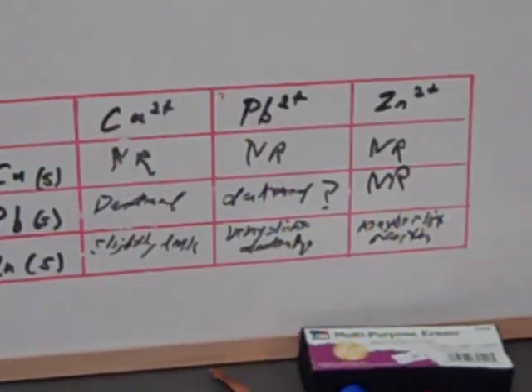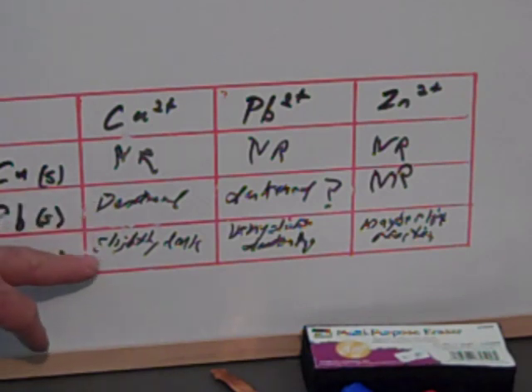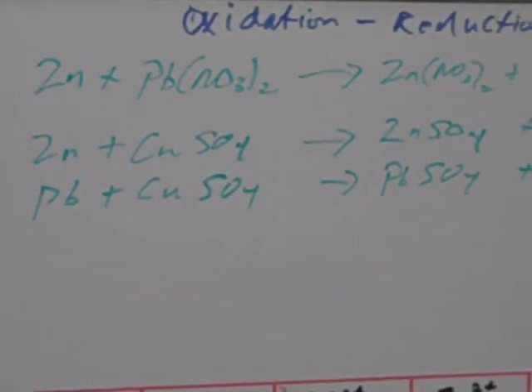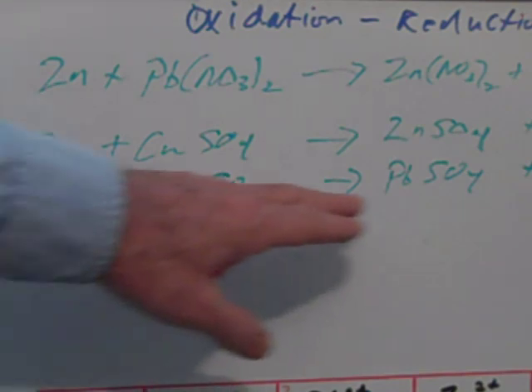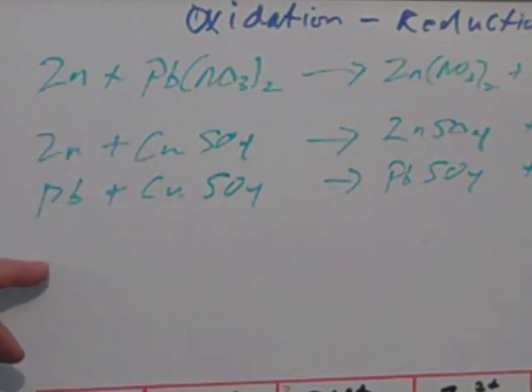For your table, when you fill it out, the copper sulfate, no reaction with the copper metal. The solid lead reacted, darkened anyhow, and the zinc slightly darkened. So we expected that. If you look up here, we expected the lead to react with the copper sulfate. We expected the zinc to react with the copper sulfate, but both of them were oxidized. Okay, but we did not expect the copper to react with the copper sulfate, and that's what we got.